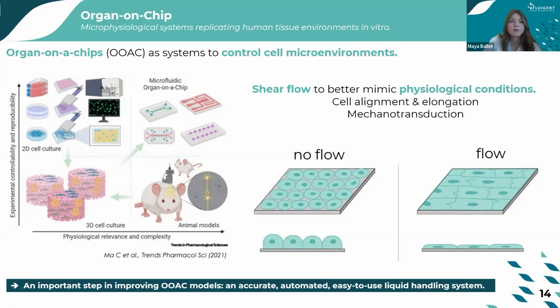And also for organ-on-chip, we are working in microchips. Because microfluidic channels are extremely small, even small variations in the flow can completely modify the shear stress. That's why solutions like manual pipetting or pumps with pulsation that introduce oscillation inside the flow, the cell can interpret it as an abnormal mechanical stress, and for sensitive cells, we have to avoid that.